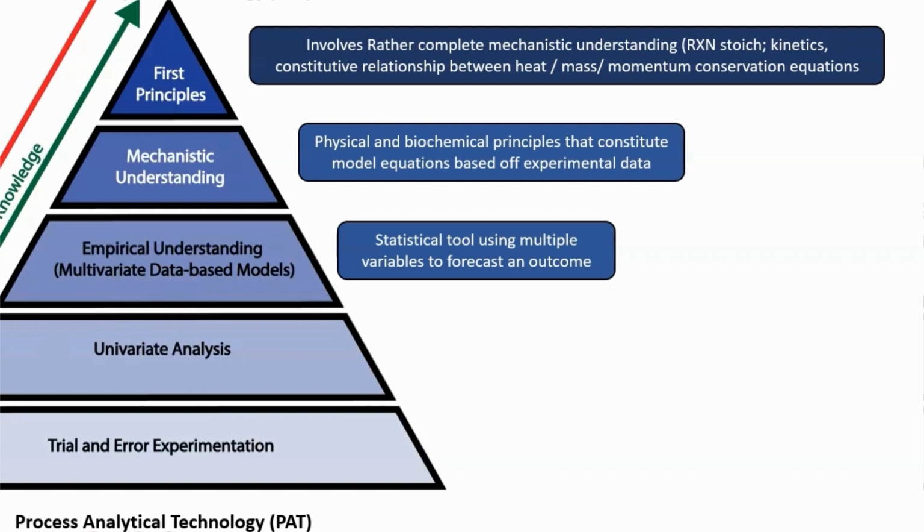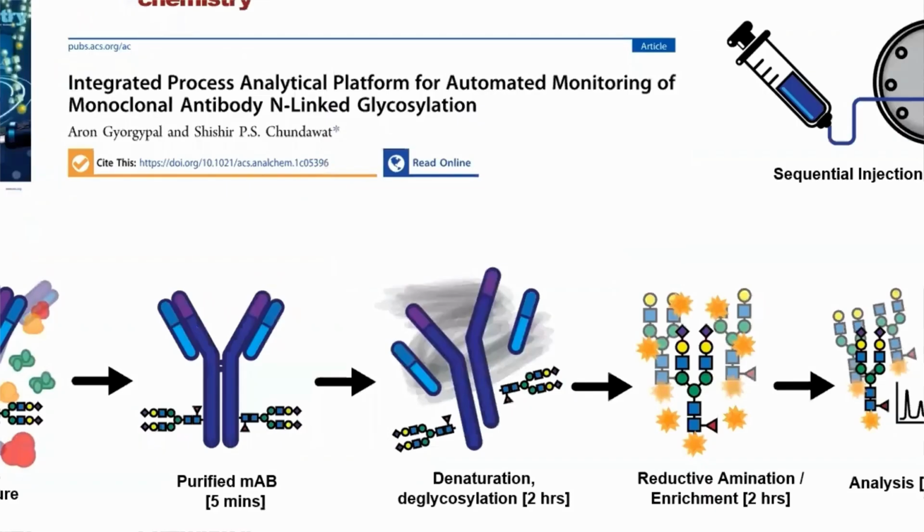So if we have multiple equations that explain the reactions, we can better understand the process. And as we go down, we have an increasing regulatory need of oversight, right? So if we do not understand the process very well, the FDA will be more concerned with what's actually taking place and how our reactions are taking place and how the product is being produced.